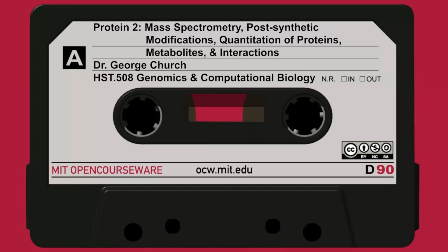2 orders of magnitude, that is to say some peaks are 100 times more intense than others. Then you might get discouraged and say, oh, this isn't a quantitative science at all. I can't deal with a factor of 100 difference. But I think you need to reassess that when people say that mass spectrometry is not quantitative.